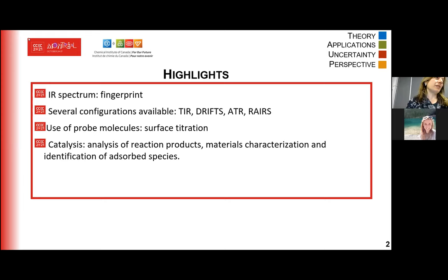I would say that the most interesting application is in catalysis, since with this technique we can monitor a reaction, because we can monitor the reaction products of a chemical reaction. We can also use this technique for the material characterization of catalytic materials. And we can use this spectroscopy for the identification of adsorbed species, which is very useful in catalysis for the identification of active sites, active species, spectators, and so on. So we can have very useful information about the mechanism of a reaction through this technique.